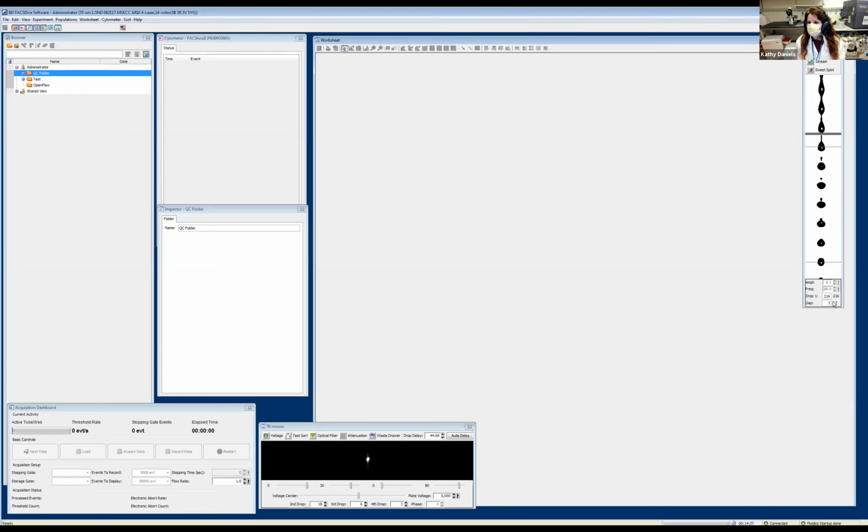What's important to remember here when we're at the sorters is that any slight changes to temperature or humidity can make minor adjustments to where that drop 1 position will fall day to day. So a value that's different by 100 is a larger change. A value that's different by about 10 or 11 is not so dramatic.